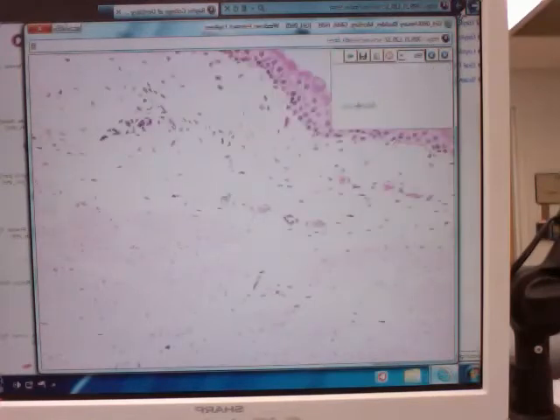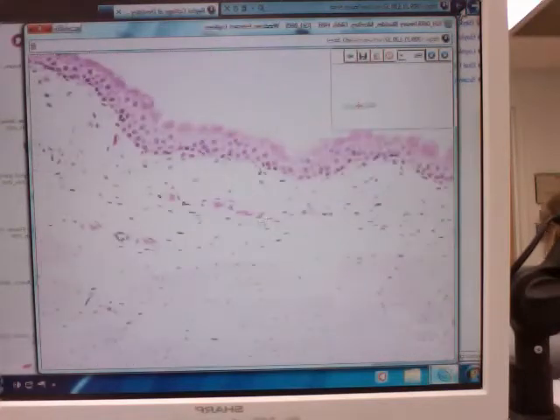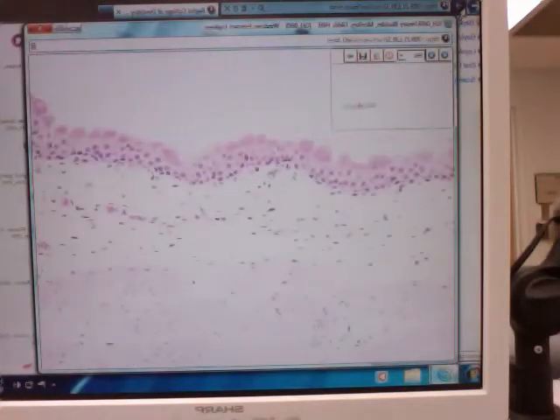So as you scan around things, when you see those pockets of a fair amount of cells with the pink fibers around it, all this pink is collagen fibers. So this stuff is all examples of loose connective tissue. Okay? And right underneath an epithelium, typically, loose connective tissue.